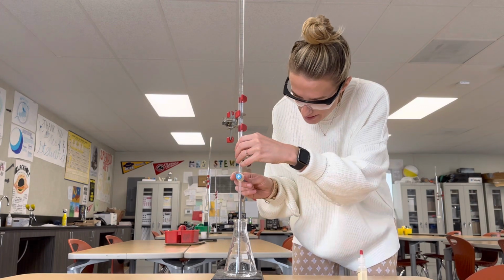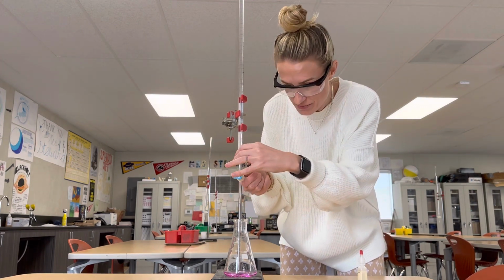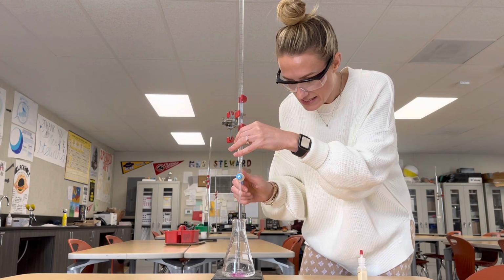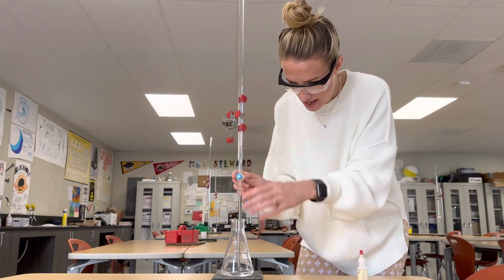So I just add a little bit. At the beginning, you kind of add a little bit more just because we are more acidic, and you can see that pretty pink color actually disappears. And so I'm going to keep adding it until it takes longer to disappear, and we swirl it around like this. Keep adding.